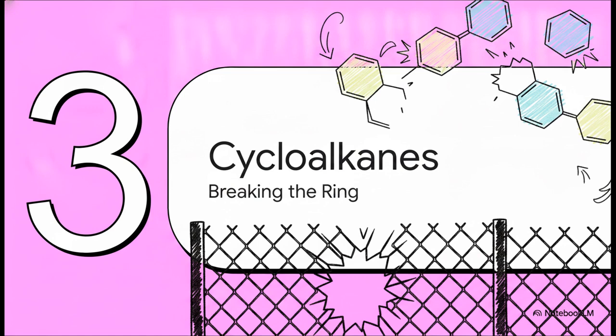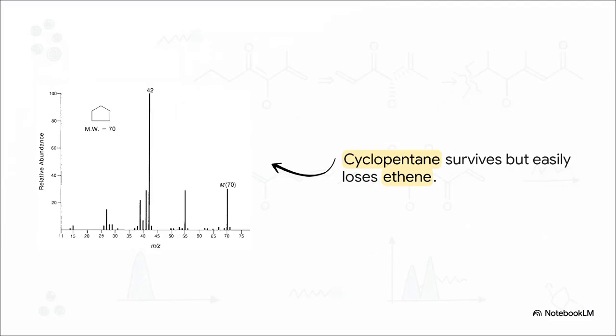Section 3, cycloalkanes, breaking the ring. Here we have the spectrum for cyclopentane.